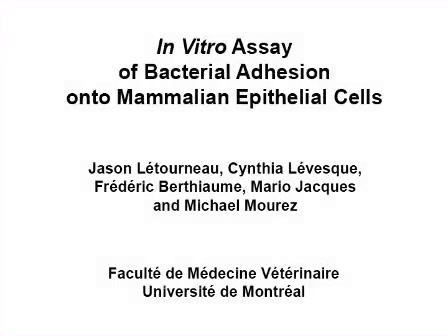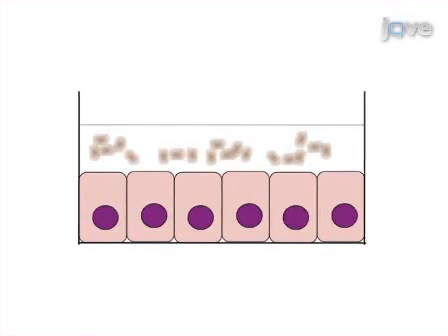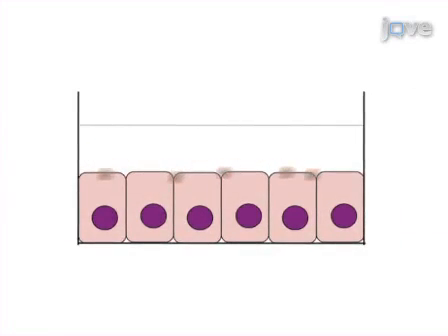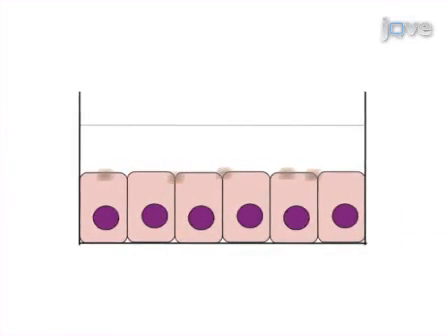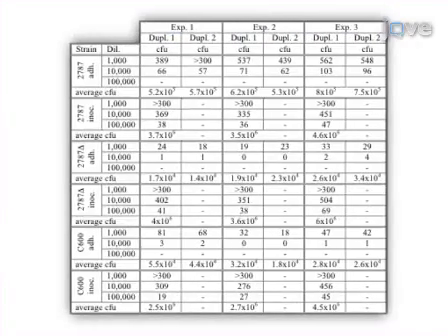The overall goal of this procedure is to quantify adhesion of bacteria onto cultured mammalian cells. This is accomplished by first incubating bacteria with cultured cells for a period of time. Next, the unbound bacteria are washed away. Then the cells are lysed to recover the adhered bacteria. Finally, the recovered bacteria are plated on petri dishes. Results can be obtained that show the number of bacteria adhered to mammalian cells through counting of the number of colony-forming units on the petri dishes.